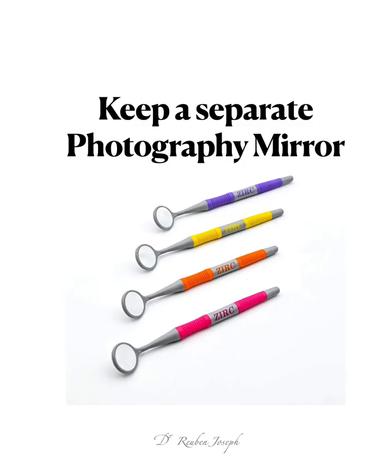One other thing you can do, or one thing I do routinely, is I have a separate set of mirrors that I use exclusively for taking photos only. I do not use them for routine work because during routine work we tend to scratch the mirrors. So I would take pictures with these photography mirrors and I'll put them back safely so that they stay in the best of shape and do not compromise the image output.